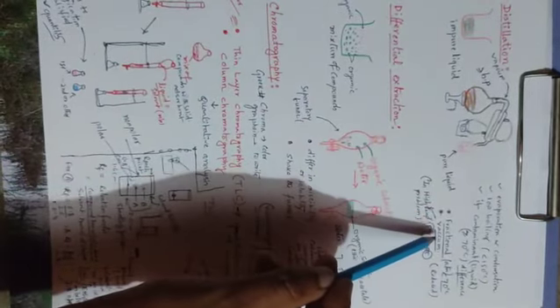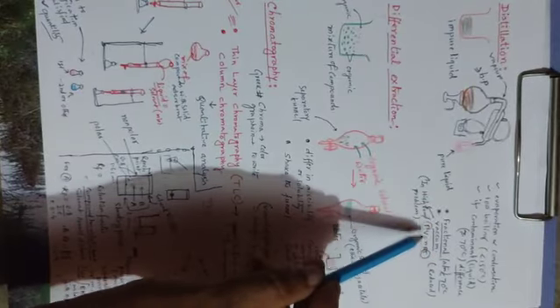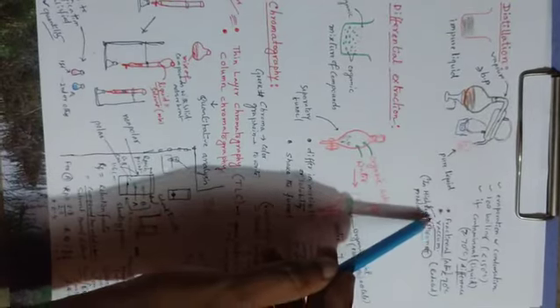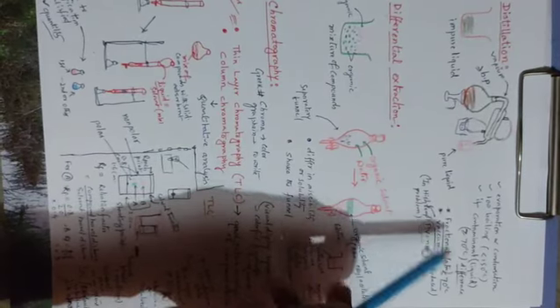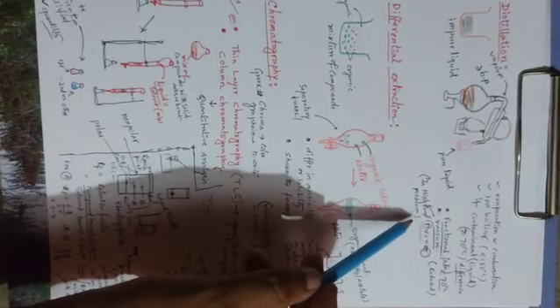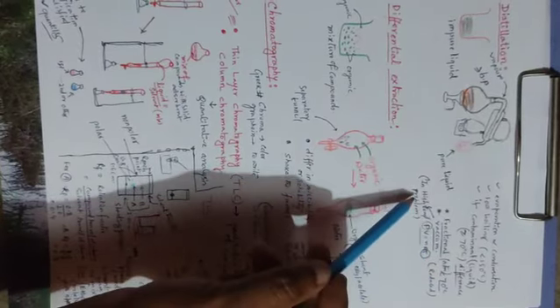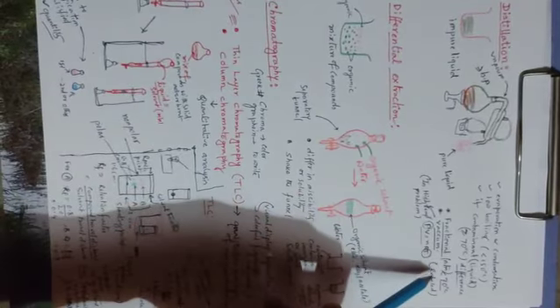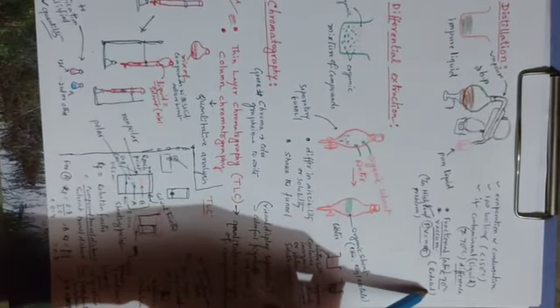Another distillation process is called vacuum distillation, which is carried out under reduced pressure, because in some cases when the temperature is high, some liquids or compounds have the ability to degrade. So in that case we should reduce the pressure.